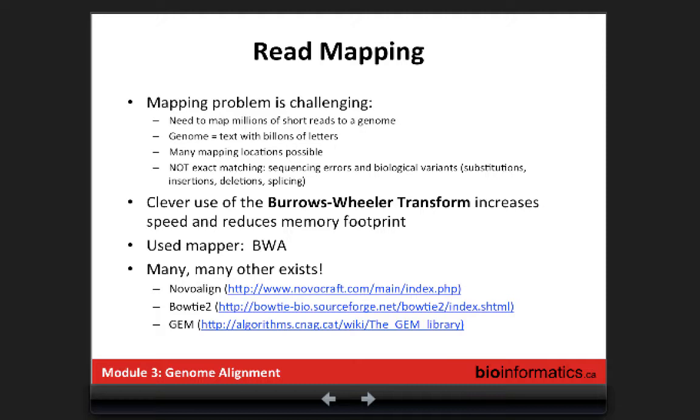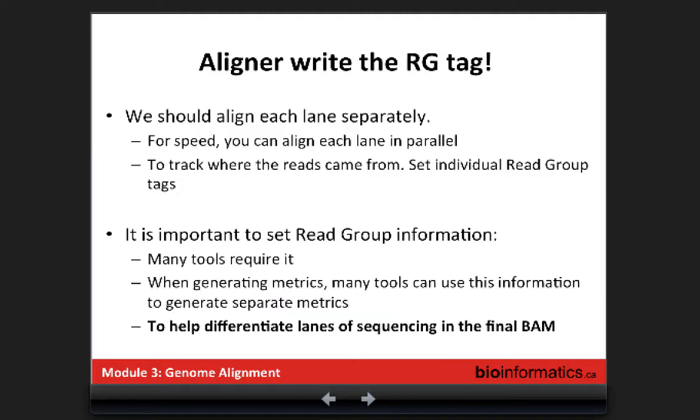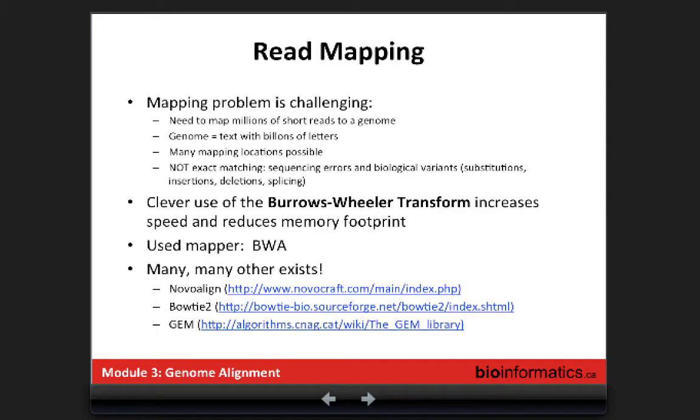Why do we use BWA-MEM? Because it has been shown to be one of the best mappers in terms of accuracy. The one that would perform better than BWA is NovoAlign, and we don't usually use it because it has licensing. It's not totally free, so I don't want to push you to purchase a license, because BWA is good enough to do the work. There are other good ones. For example, Bowtie is really good as an aligner, especially for RNA or when you want to extract exact matches. There are a lot of reviews about each aligner that pop up every one or two years.